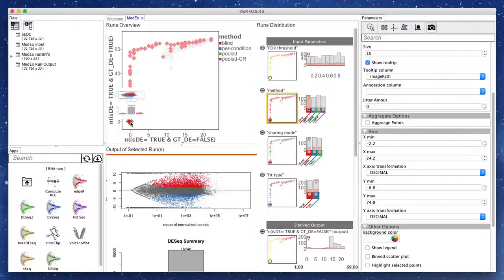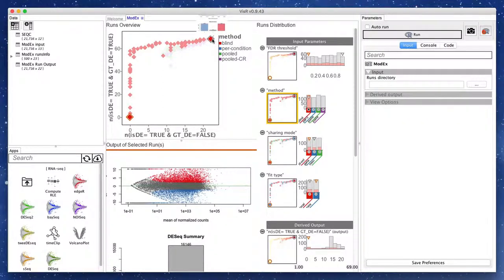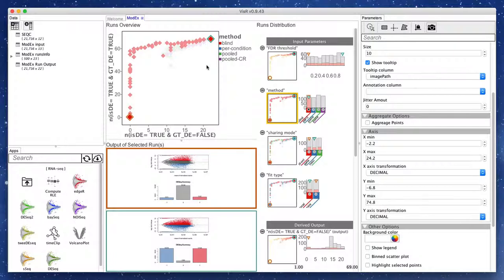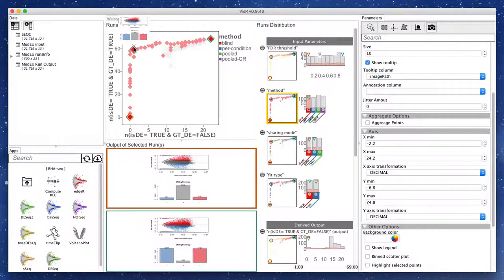Clicking on the data point for a run shows the plot generated by the computer model after executing that run. Multiple runs can also be selected. Here we compare runs on the far ends of the Pareto set with a mid-range one.